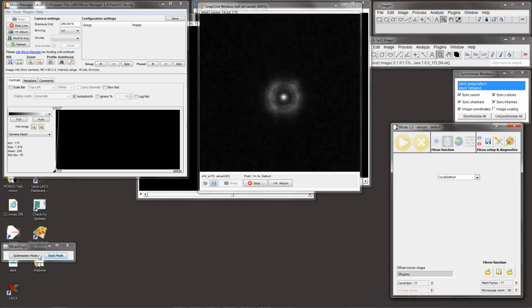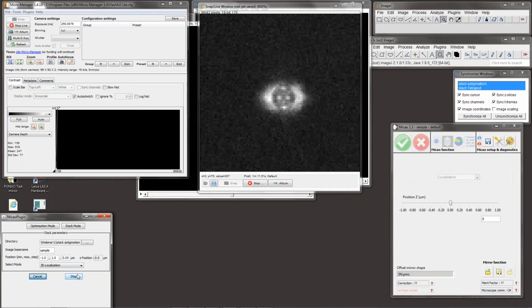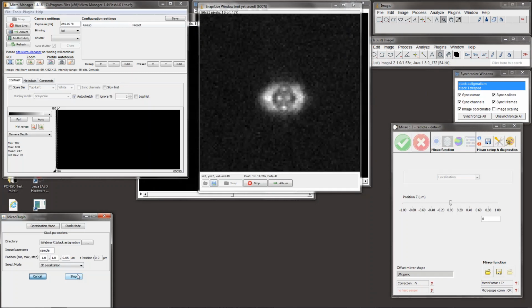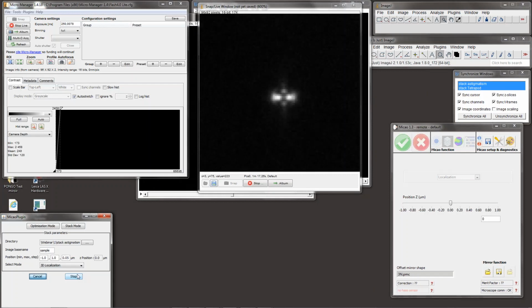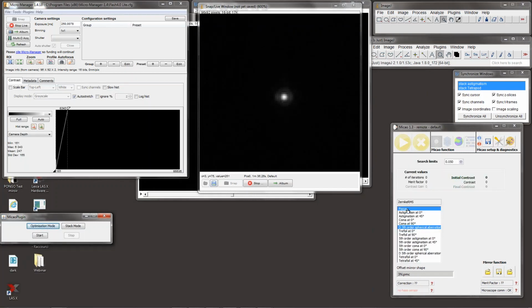So if I apply astigmatism now, you can see that it's distorted and not very usable. Like it splits into two dots very quickly, and almost doesn't extend on the other side of the focus. So I will now try to selectively correct for spherical aberration and maybe some other aberrations which might occur in order to basically restore astigmatic imaging.